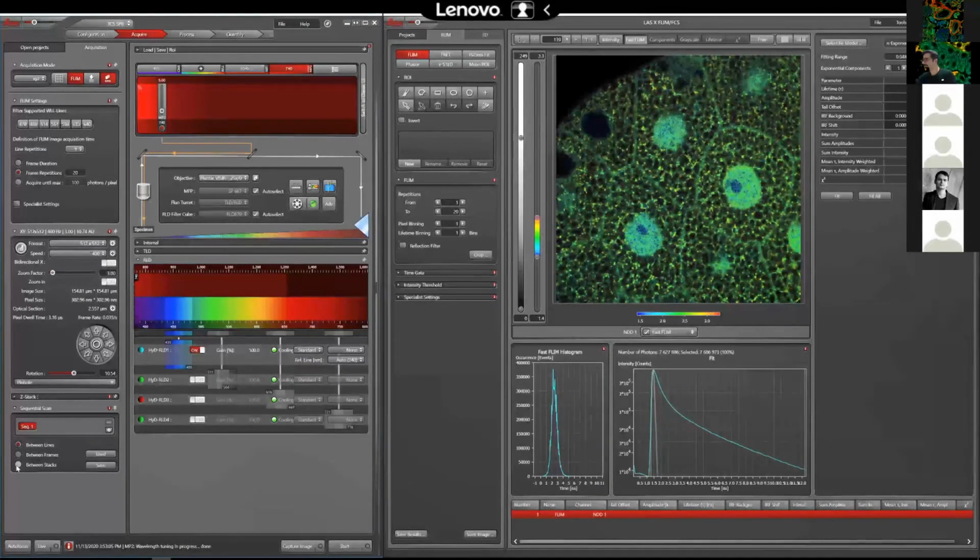However, I would like to mention, yes, this was a good point, thinking of a longer decay window. And that's what I've thought of. Fabian yesterday mentioned that the timing between pulses should extend 10 times the lifetime you're planning to obtain. So in this context, yes, a slightly slower repetition rate would probably lead to better lifetime data.